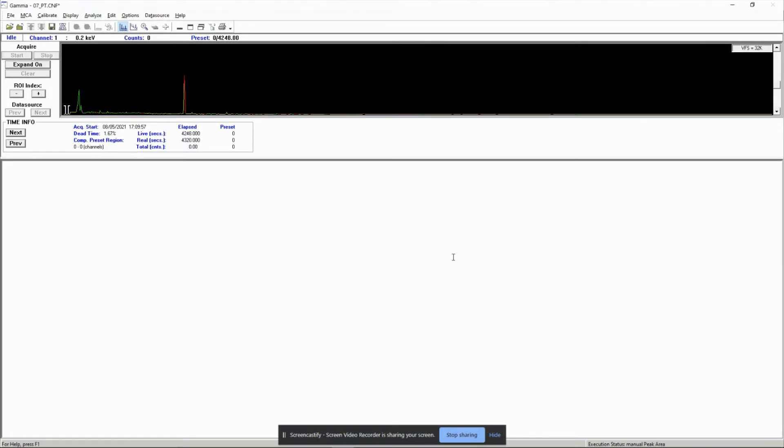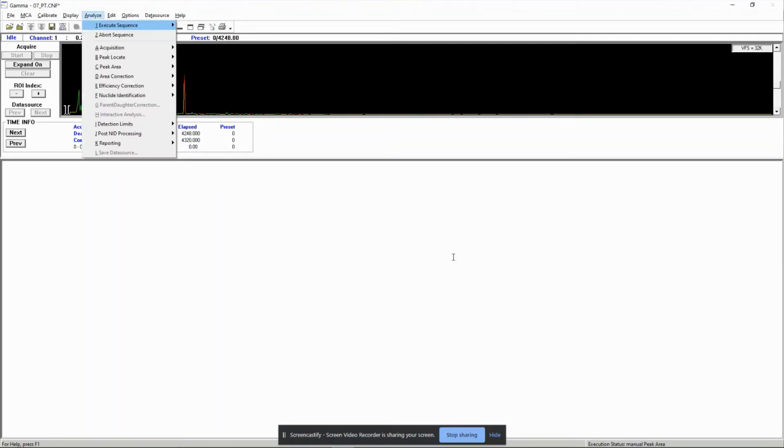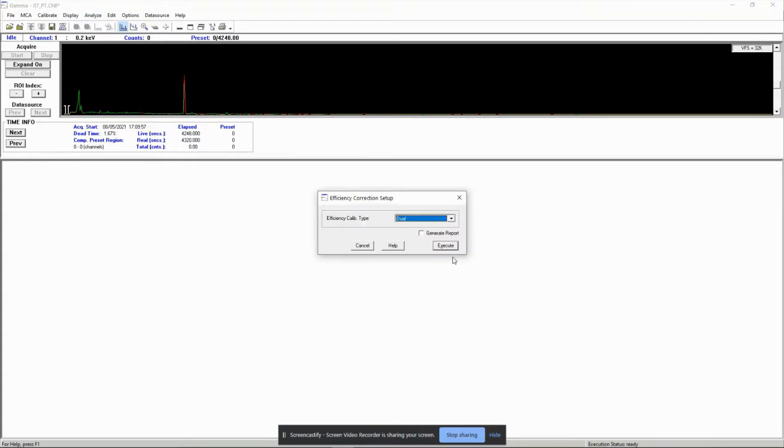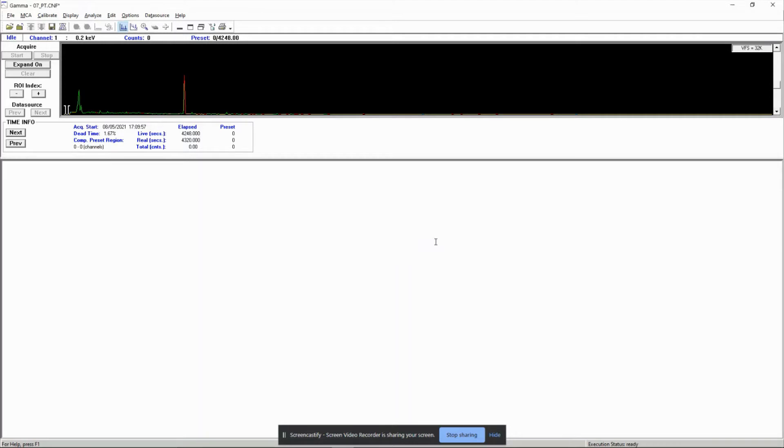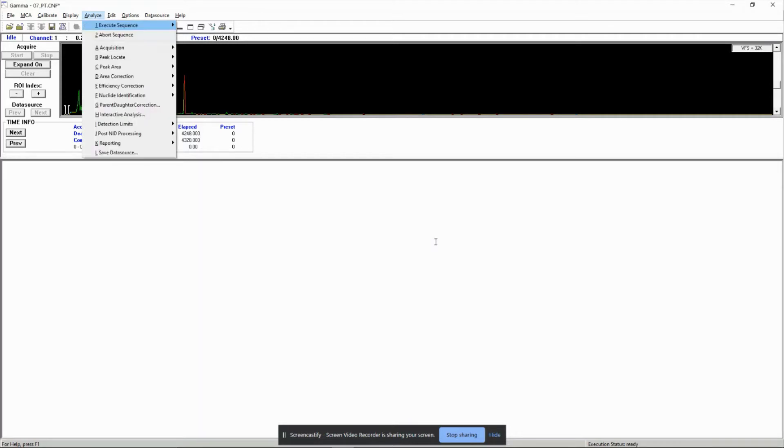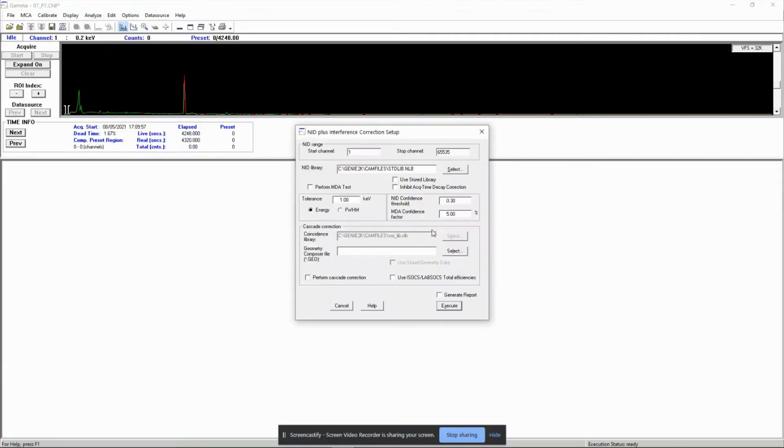Step three: efficiency correction standard. I chose the interpolated option because I have already calibrated the detector efficiency using MCNP and entered all the efficiency values using calibrate efficiency by entry.